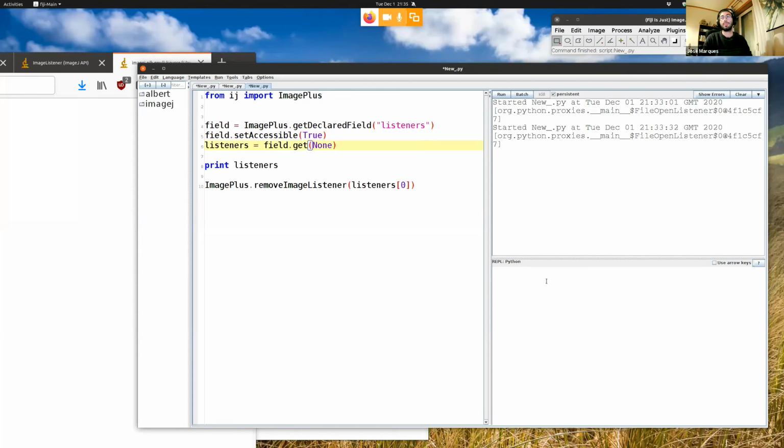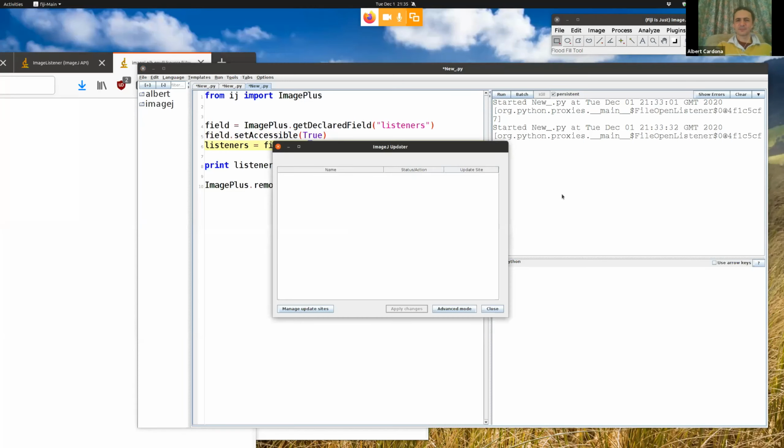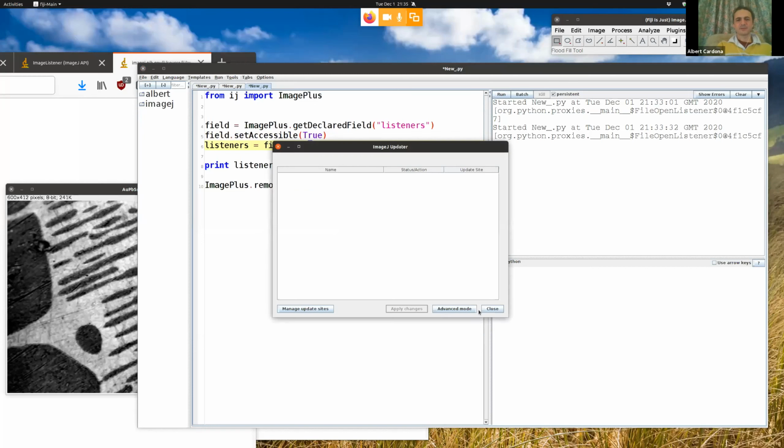I identified the bug today, and I don't have that autocomplete. I don't know whether it's already in the updater or not. If I run the updater, what does it say? Because it takes some time from when I push it to when it appears in the updater. The updater will come up in a moment. No, it's still not there. You can install it from Maven, but maybe we can touch that in a moment.